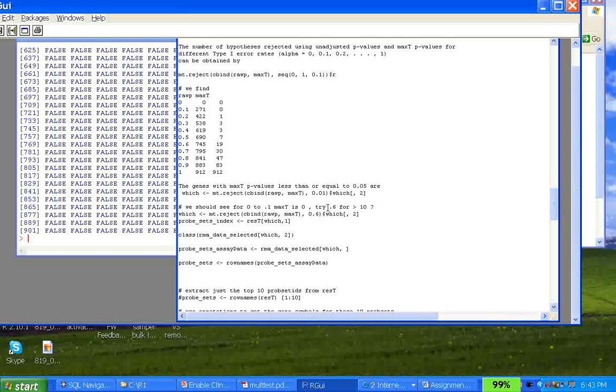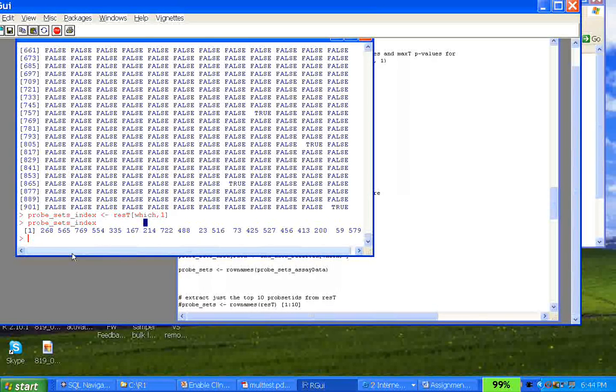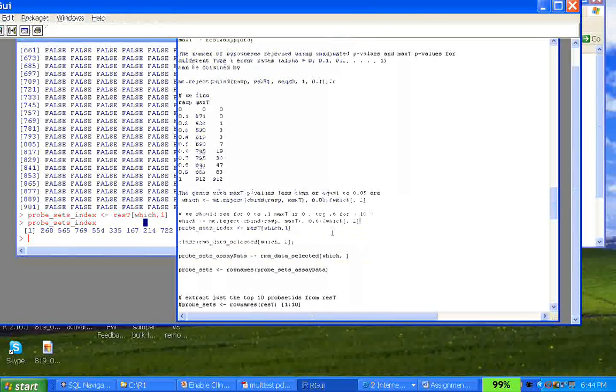Anyway, I digressed from where we were. Okay, so if we do this now, based on the data frame on column 1, we're going to get some indexes. We're going to get 19 or so indexes, I thought, right? Or 0.6 should give me 19, right? So verify it. What happens is I do get those. So these are all the indexes that I got, 19 of them.